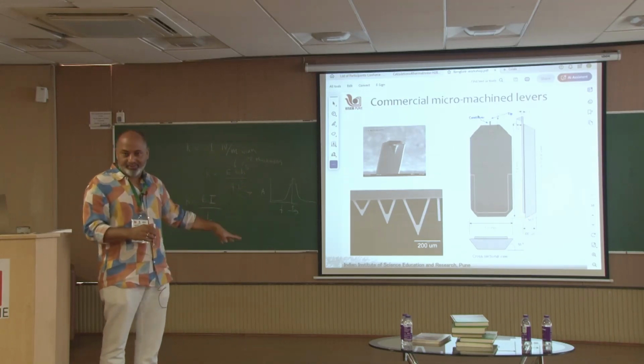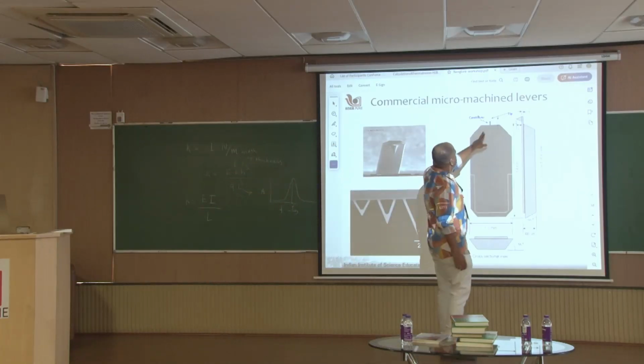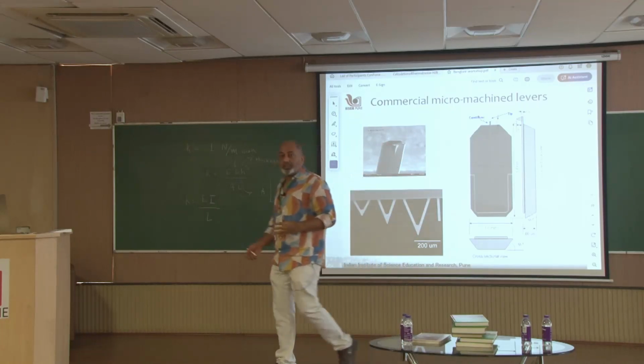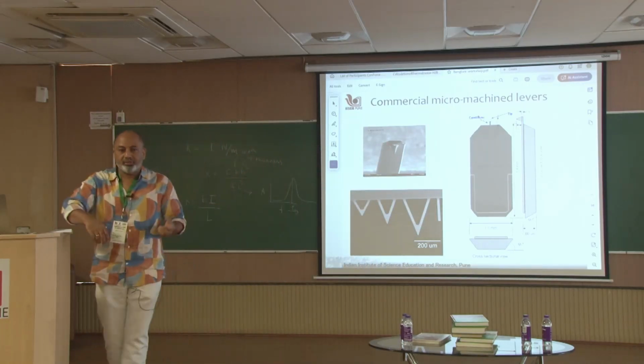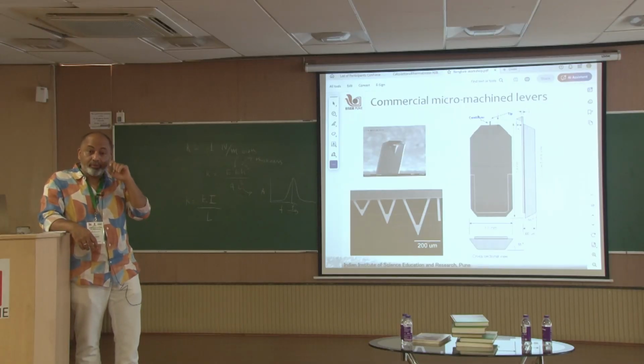Yes, this is one monolith. So this is the whole cantilever. This thing that is protruding out is one material. That's important for the chip industry. No, it's a monolithic thing. No, one silicon wafer, single crystal.